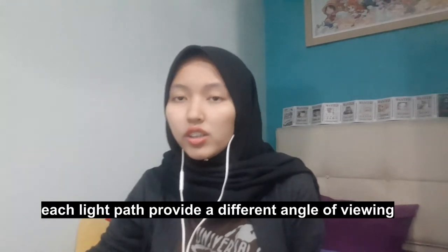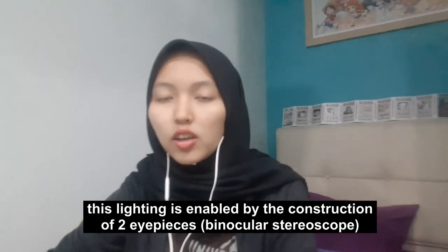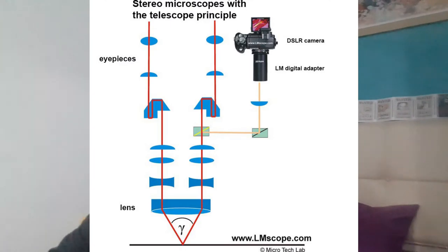The working principle of stereo microscope depends on the two types of light path used by microscope objective and eyepiece. Each light path provides a different angle of viewing. They have the top light, which is used while dissecting, and the bottom light, which is used to view the image. This lighting is enabled by the construction of two eyepieces, which is the binocular stereoscope. One shows a different type of light pathway, and another one provides a viewing comfort area.